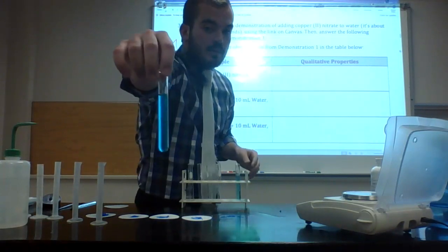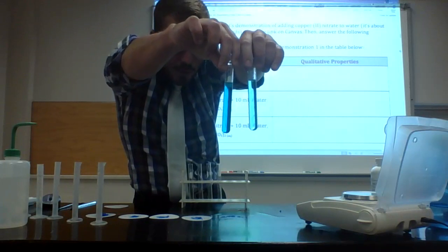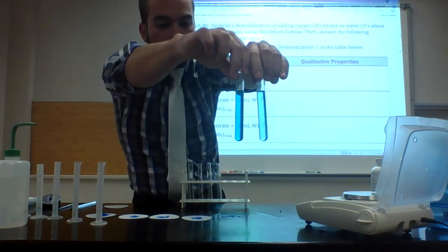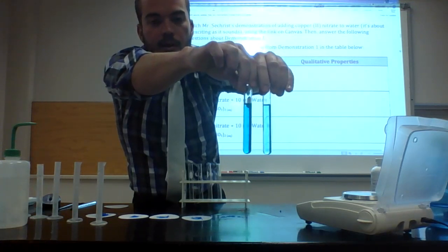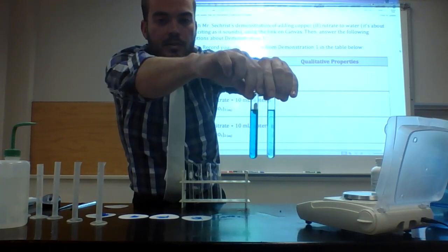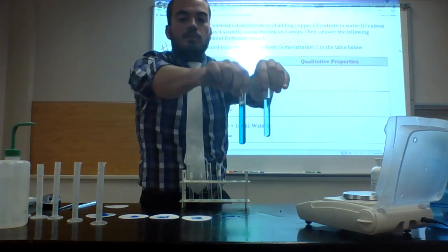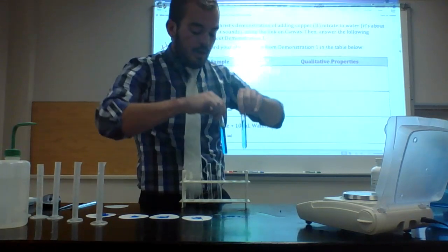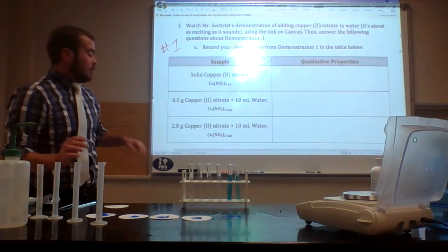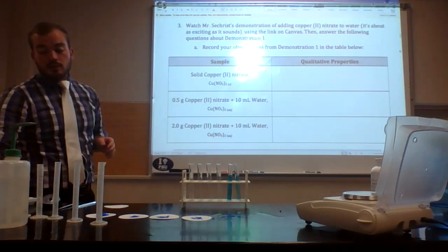So after that mixes up, you can see we have a darker blue solution. On your right is 0.5 grams, on your left is 2 grams. It's not a dramatic difference but it's a noticeable difference. This one on the left is darker, the 2 grams is darker. Make sure you record that and then we'll scroll down to the next demo.